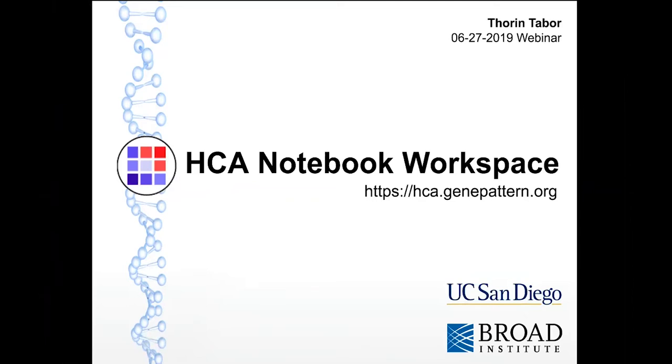In the webinar today, I'm going to briefly go over the platforms that we integrate, Jupyter and GenePattern. I'm also going to talk a bit about how they can be used to access HCA data. And then I'm going to walk you through several bioinformatic notebooks along the way, pointing out the features that the Notebook Workspace offers and how you can use those features in your own research.